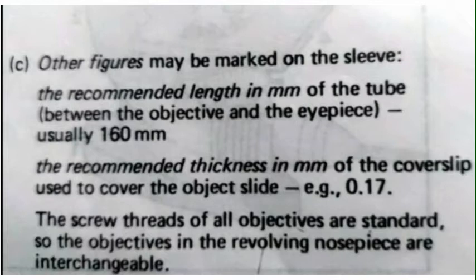The screw threads of all objectives are standard, so the objectives in the revolving nose pieces are interchangeable.